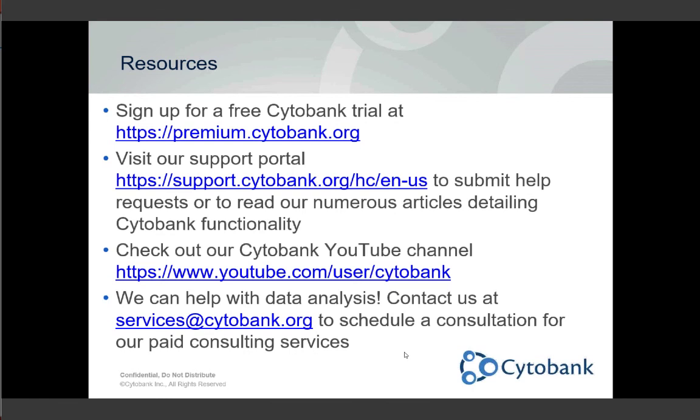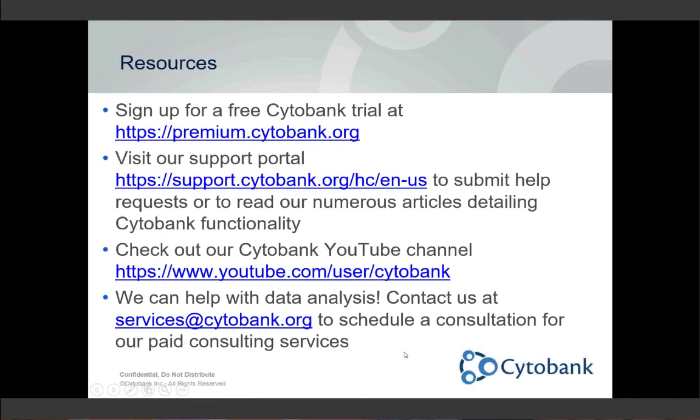Mm-hmm. Let's see. Someone actually had a question. They were curious, so you used Cytobank data in your workflow, and they were wondering, could you follow a similar workflow that Rima presented with fluorescent data? I think I can comment on that as well. I'd say absolutely. As far as the parts of the workflow that Rima showed, folks on Cytobank have used viSNE for both fluorescent and mass data. You can certainly do any of the bi-exponential plots with your fluorescent data as well.